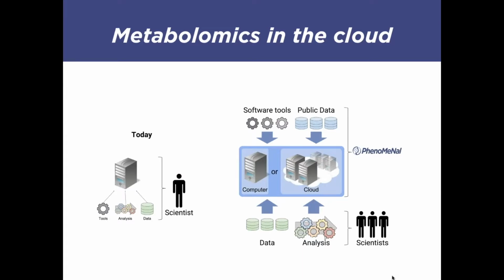So as I was saying, this allows you to scale in your analysis. So if you suddenly have now a data set that is 10 or 100 or 1,000 times bigger than your previous data sets, you simply can use more machines. Or if you are in a hurry and you need to have your analysis done faster, you can always sort of scale up, use more computing power on the cloud with the same analysis tools and get your results. And I will show in the end some examples of how this was sped up for some analysis.